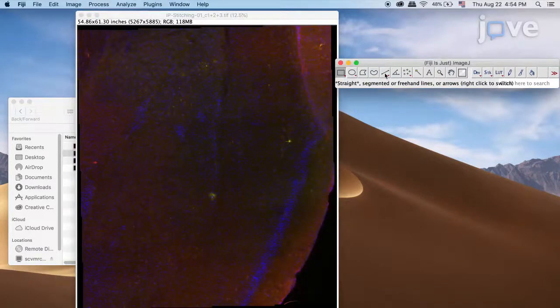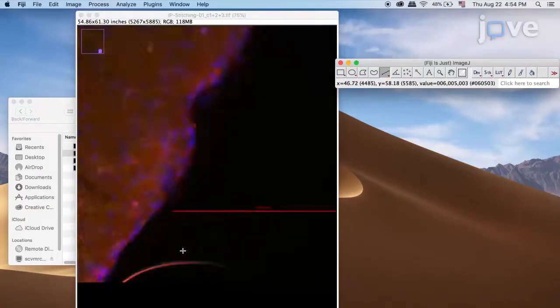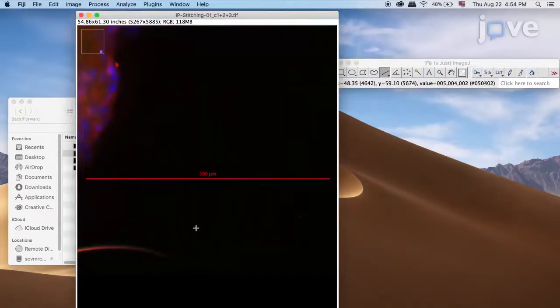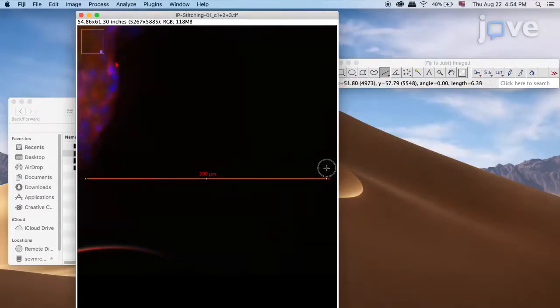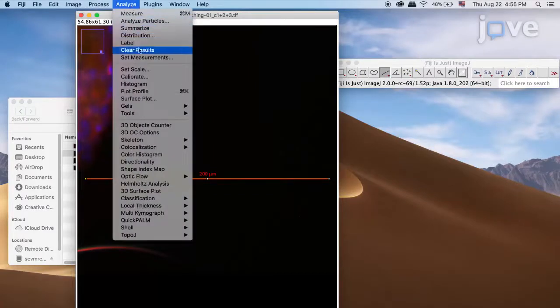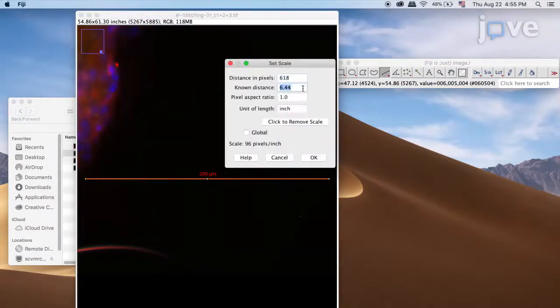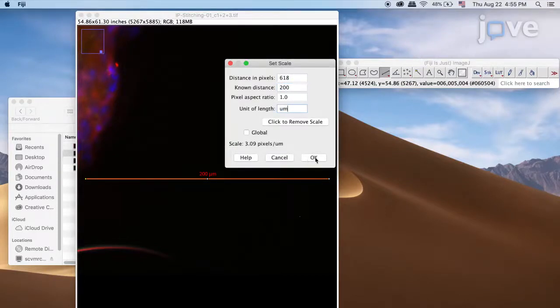To set the scale manually based on a scale imprinted on the image, select the Straight Line tool. Place the cursor on the edge of the scale, and while pressing the Shift key, draw a line as close as possible to the scale on the image. Select Analyze, Set Scale. A window will pop up. Input the correct known distance and unit of length to determine the pixels per length unit, and click OK.